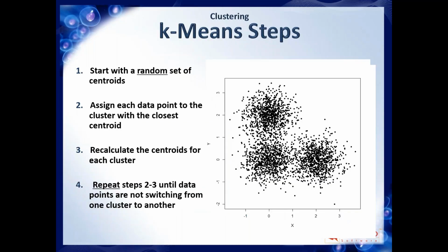So let's see how K-means works. You define the number of clusters.